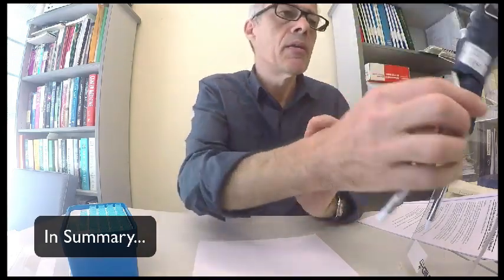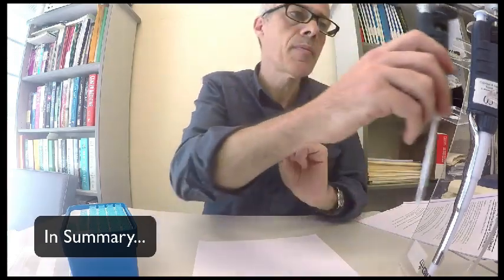Important things are the choice of the right pipette for the volume that you want to dispense. The next thing you need to be aware of is setting the appropriate volume here on the dial and not getting confused by the number. To help with confusion, have a look at the maximum volume it can dispense and what the maximum scale is. If it's a P1000 and it's showing 100, then obviously that 100 represents 1000, and therefore 90 represents 900. For some of them it's easier. P200, the maximum unit here is 200, and therefore 200 on the scale is 200 microliters. 180 on the scale is 180 microliters.